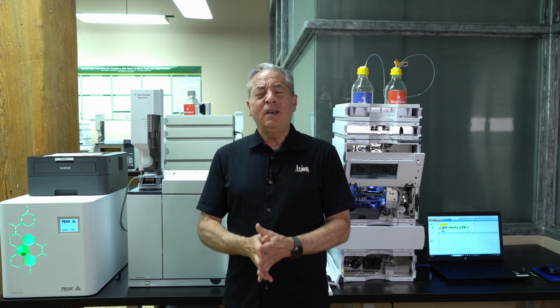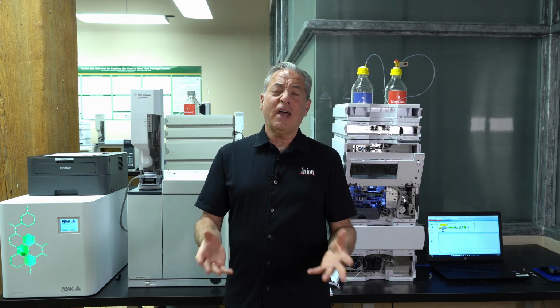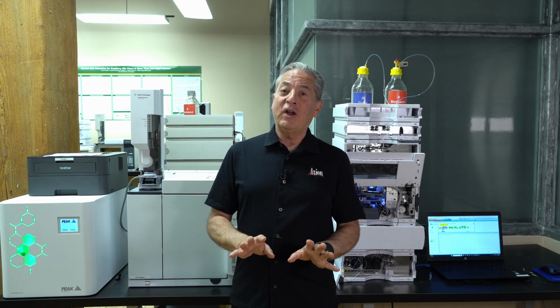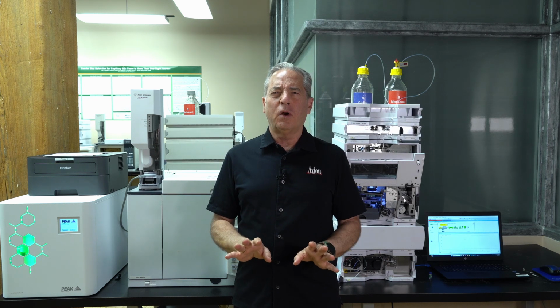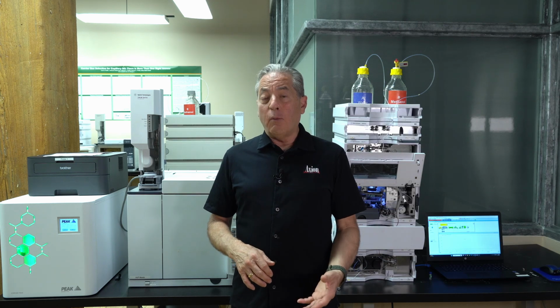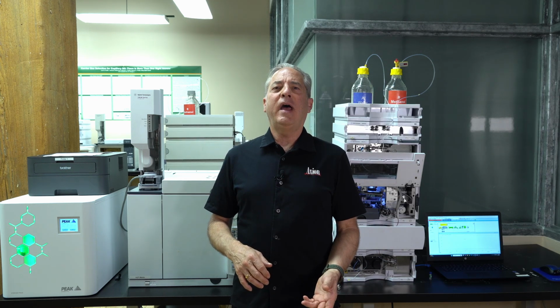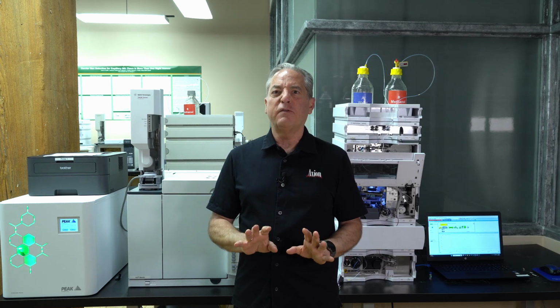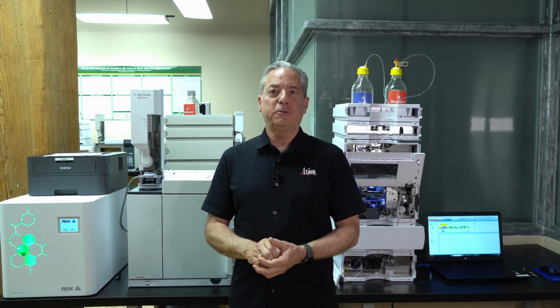In HPLC, again, it depends what the analyte is, what the matrix is, but I will give you the 85% answer, and that is 85% of the people in the world are going to choose a C18 column with either methanol water or acetonitrile water as the mobile phase. Not the answer for everybody, but it's going to get you pretty far when you're starting off from scratch.